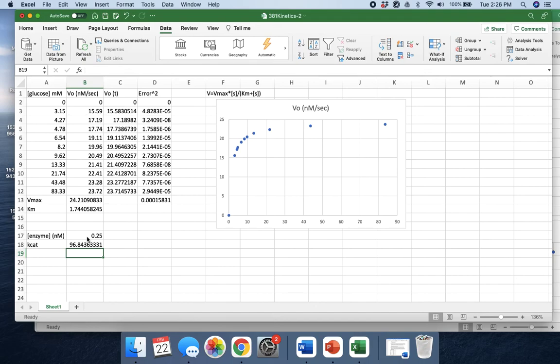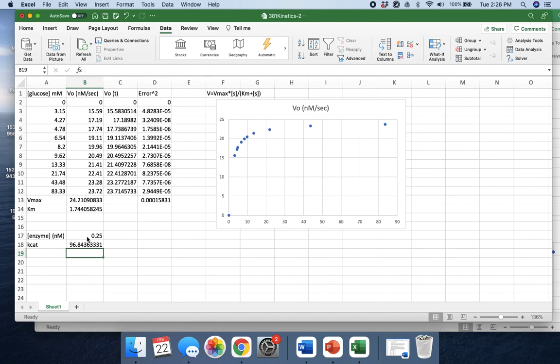If I have time, I'm going to make another video about using the Lineweaver-Burk plot to look at inhibitors, because that is the really good use of the Lineweaver-Burk plot. It's not very good for finding these values, but it is good for looking at what kind of inhibitor you're working with. But that's how you use solver. Thank you.